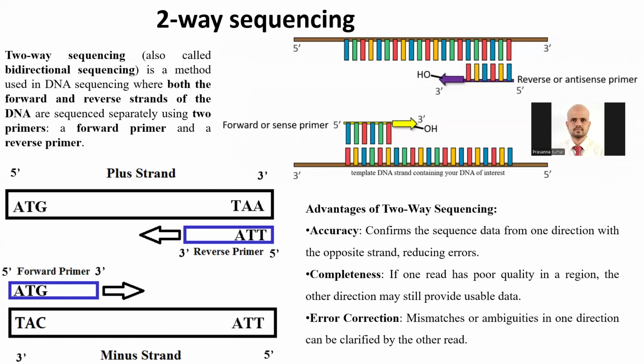And that amplicon is subjected to two sequencing reactions. So for every sample in the sequencer, there will be two samples, two single-strand PCRs. So for every sample, you will get two machine output files. Now this BioEdit is entirely about how to use these two strands, how to compile them and obtain the complete length of our target DNA, or how to check the accuracy of the DNA sequence.